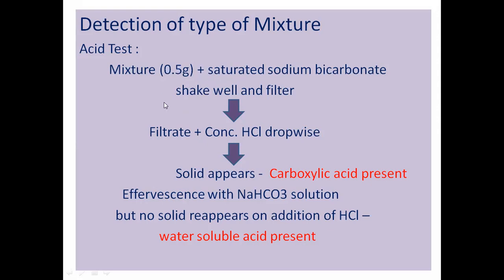If the mixture contains that acid, then when you add saturated sodium bicarbonate, it forms the sodium salt of acetate, COONa. Plus water gets formed and CO2 gets released. Okay. Then that filtrate. What we have done? We have dissolved this acid. It forms the sodium salt of acetate.